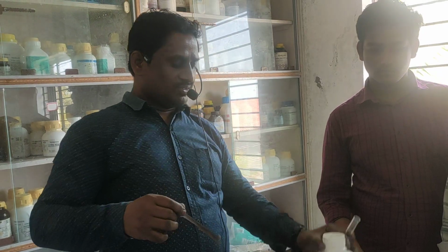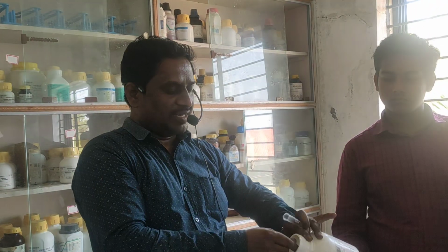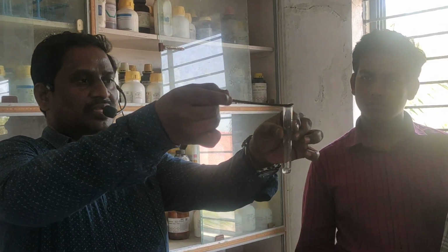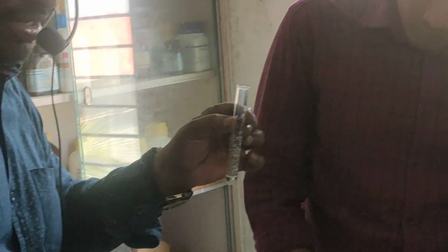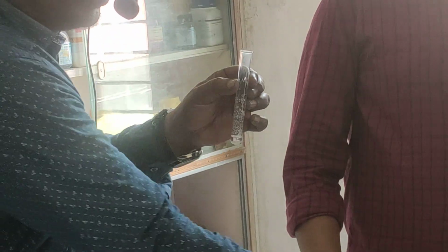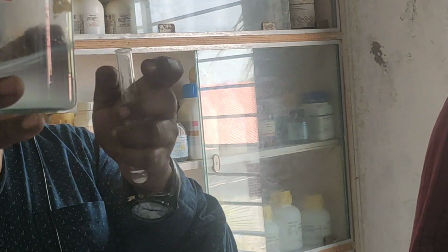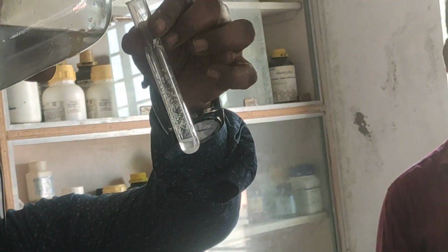Ammonium chloride is a solid, as you can observe here. I am adding this ammonium chloride to the given original solution. Along with this ammonium chloride, we have to add ammonium hydroxide. What should we add? Ammonium hydroxide. So you can observe here, this is ammonium hydroxide, and I add it.